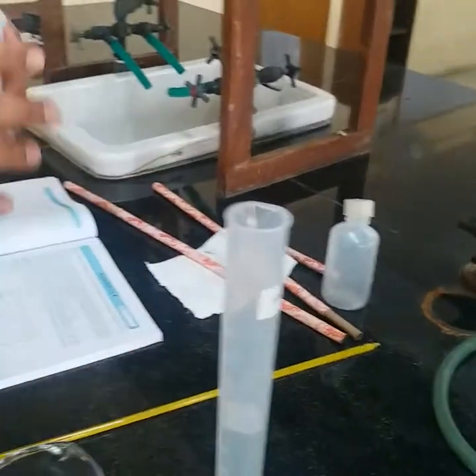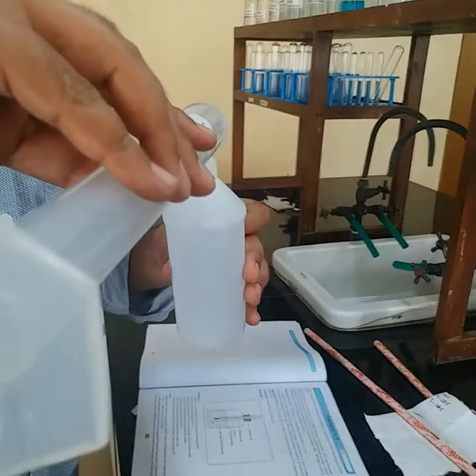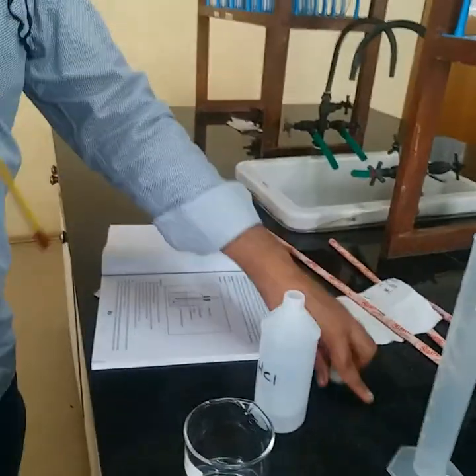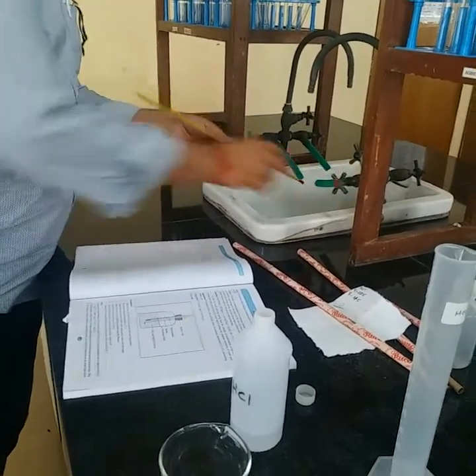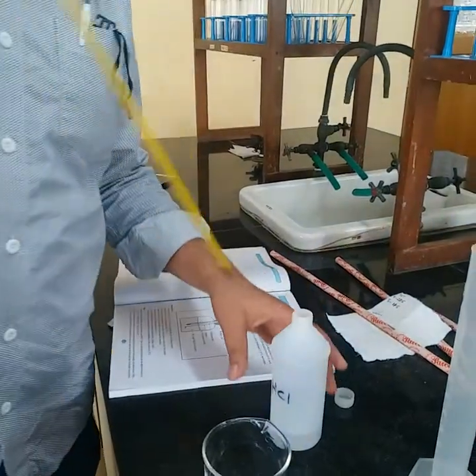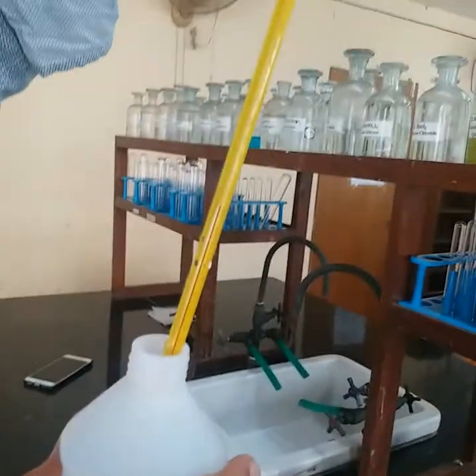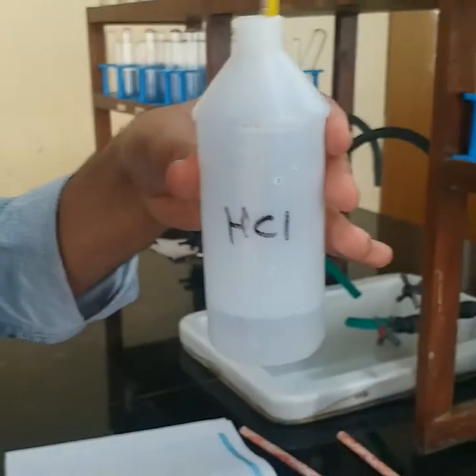Now this 50 ml of HCl I am going to transfer into this polythene bottle. I am going to measure the temperature of this HCl. It is better to wash the thermometer with water, avoiding any contamination. I am just putting it in here. As you can see on the thermometer, there is a red mark — you can see the red lining. It should be dipped immediately into the HCl solution.